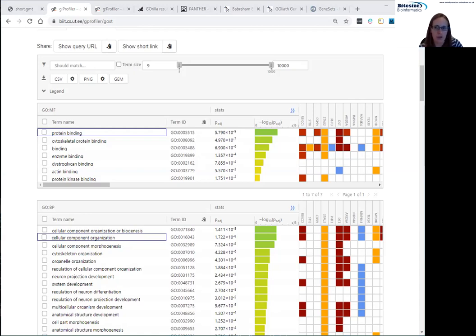We've got lots of quality control tools for examining data at various stages, looking at FastQ data, map data. But when it gets to the end of the processing and analysis, and we've just got a set of genes out at the end, if we're just given these genes, then we don't really have more information than that to go on.